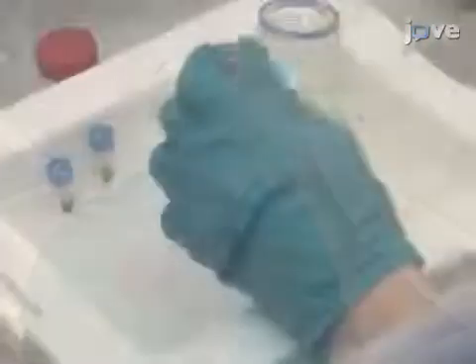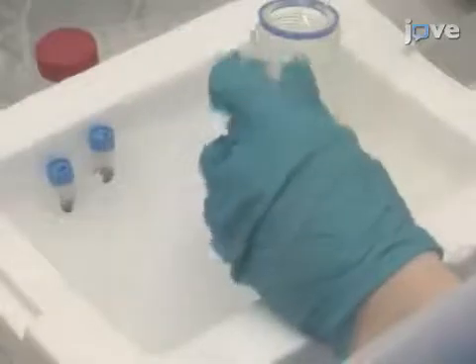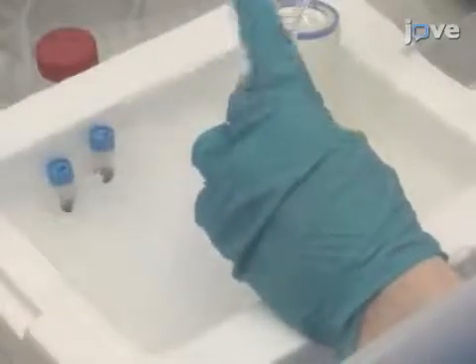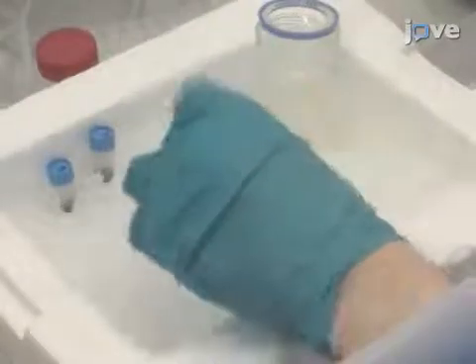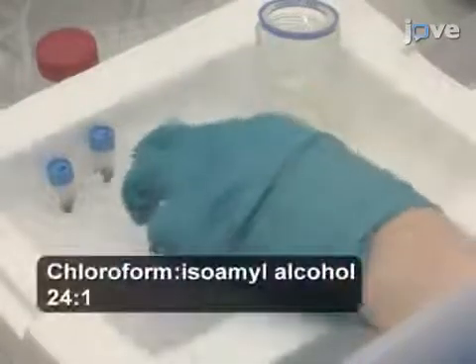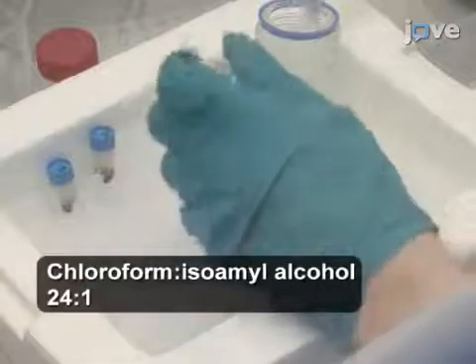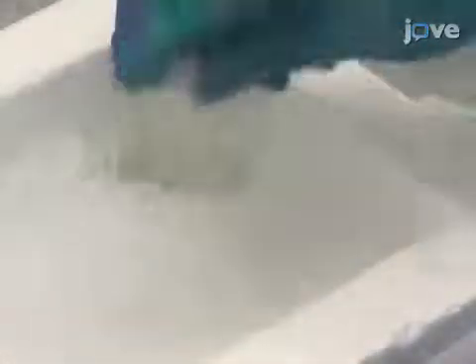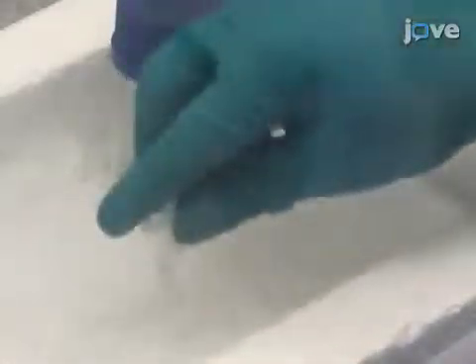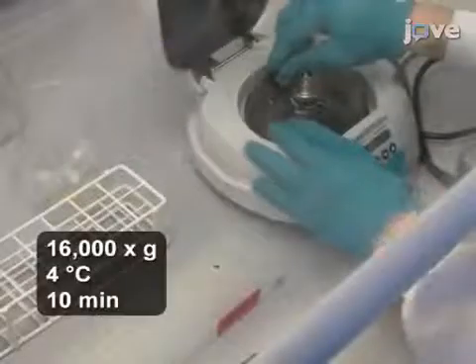Next, place the samples on ice and add 500 microliters of ice-cold chloroform isoamyl alcohol. Then invert the tube several times until an emulsion is visible and centrifuge as before.